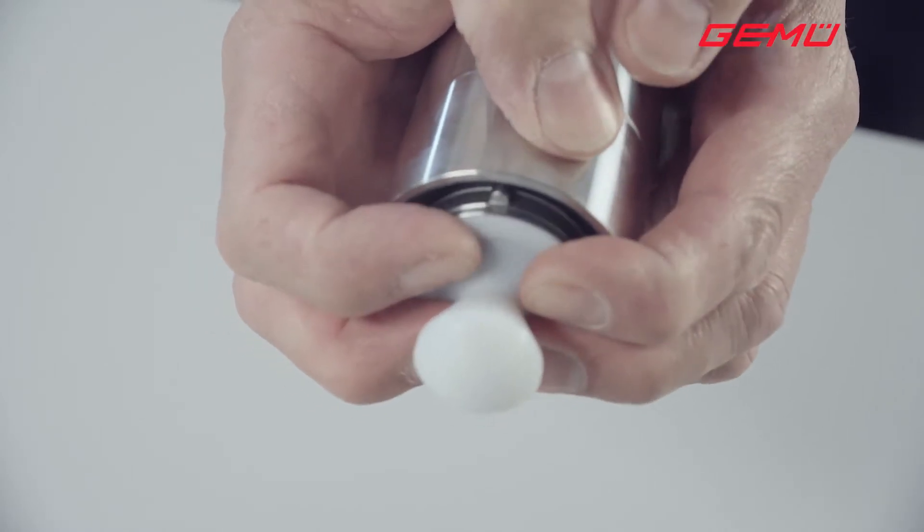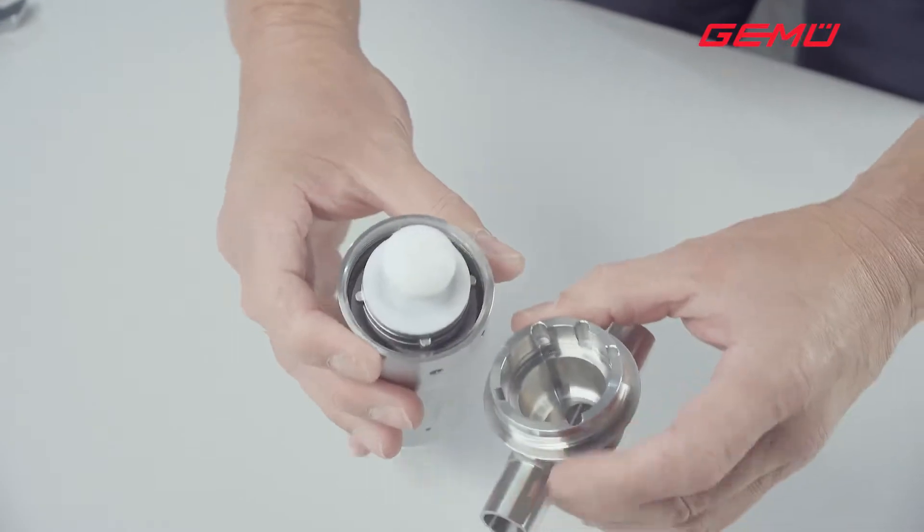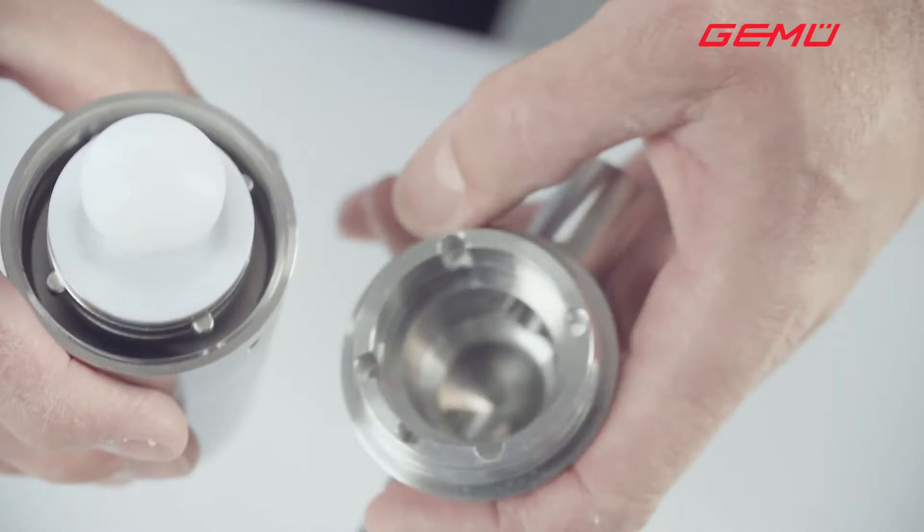Now the actuator can be refitted to the valve body. In doing this, ensure that the locking points on the actuator and the valve body are aligned on top of each other.